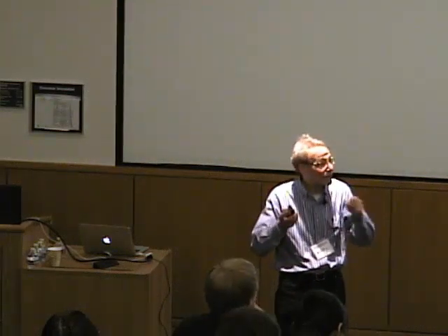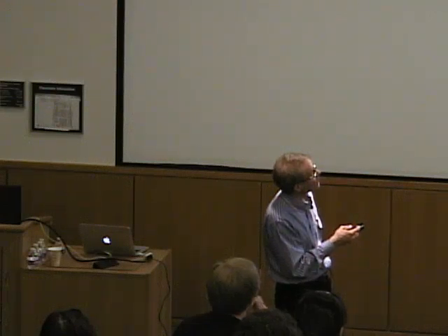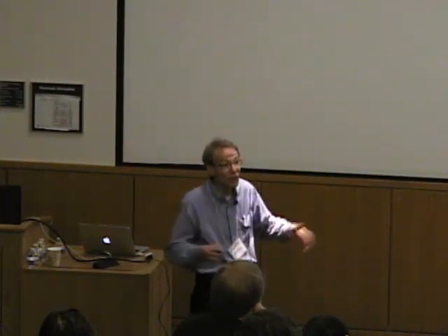Low net heat. Remember, this is the enthalpy of everything going on, and there are cases where all the enthalpies that are happening cancel each other out, and you have very little heat that's measurable. Now, luckily, mostly these binding enthalpies of phenomena that take place in aqueous solution tend to be temperature dependent. Delta Cp is not zero. So oftentimes if you shift to another temperature, that will affect these enthalpies and can lead to an increase or even a decrease of a signal. Check the conditions. You go to a different buffer.